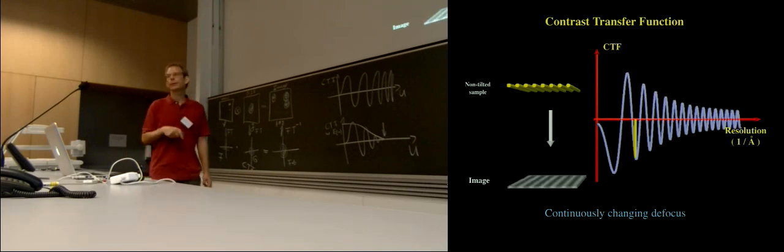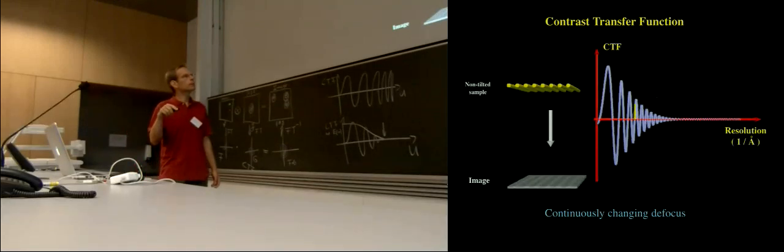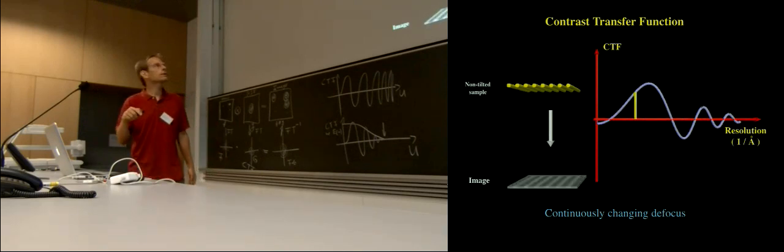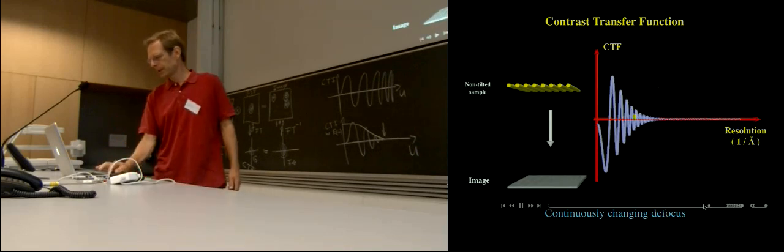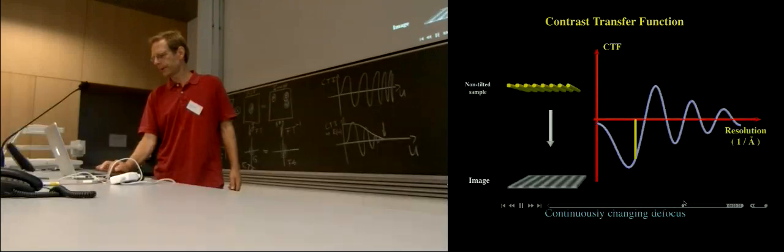This affects your image. And you can also see that a highly contrasted image is when you defocus a lot, so that you're just at a maximum. If you defocus too much, you are at the resolution limit, then you have nothing. And if you do not defocus, then it's also flat gray and you have nothing. So you need to defocus a bit, but not too much. So what you want, the ideal setting for this frequency, would probably be here.